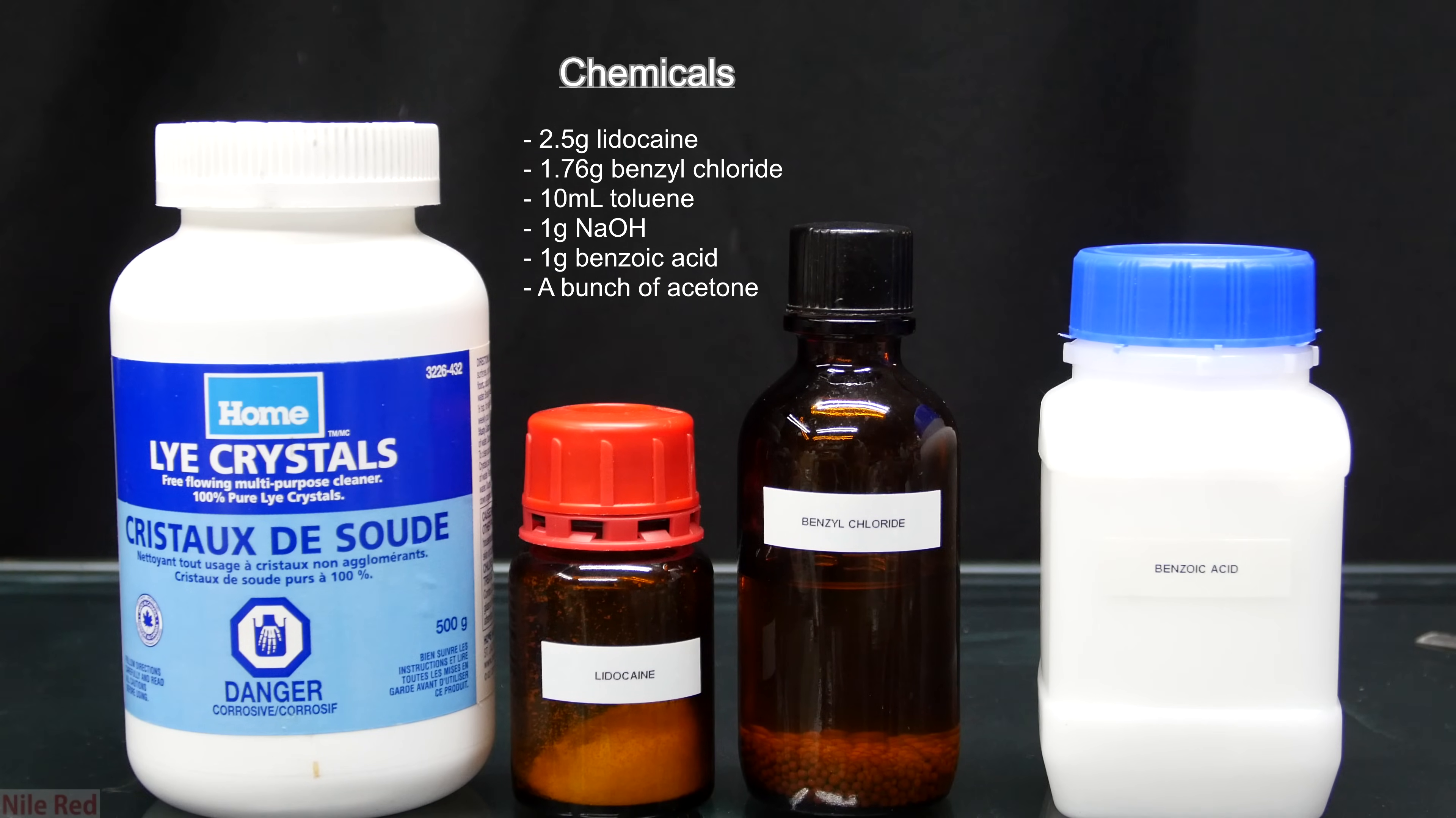Anyway, we're going to be making denatonium benzoate from three things that we got from previous videos: benzoic acid, lidocaine, and benzyl chloride. I tried to lay out everything that we used here, but as usual I forgot a couple things. I used 2.5 grams of lidocaine, 1.76 grams of benzyl chloride, about 10 milliliters of toluene, 1 gram of sodium hydroxide, 1 gram of benzoic acid, and a copious amount of acetone.